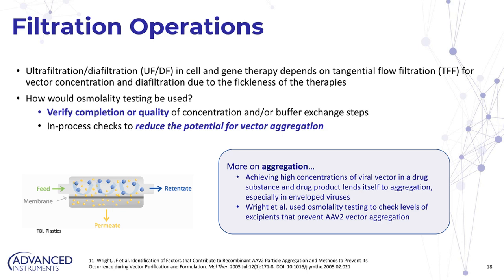So that's one piece, really monitoring your concentration and buffer exchange steps to make sure that your buffers are exactly what you're expecting, to make sure that the composition of your drug substance is what you're expecting.